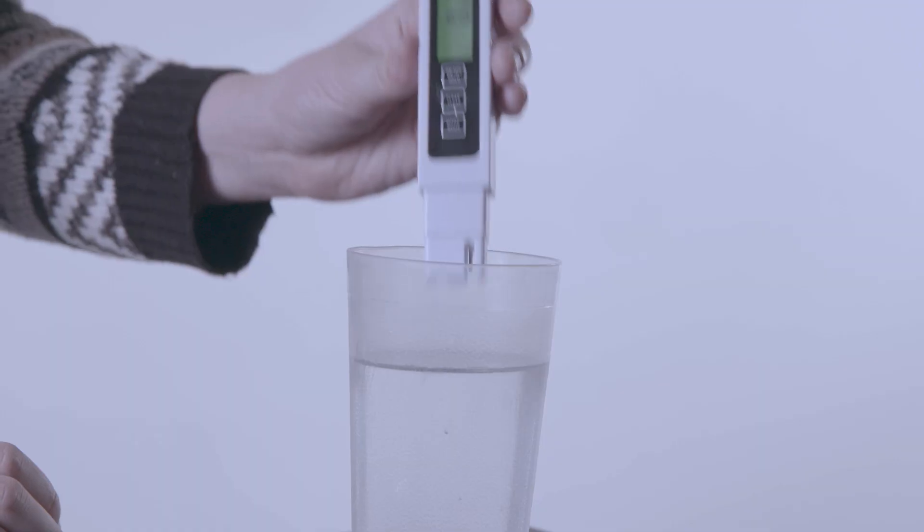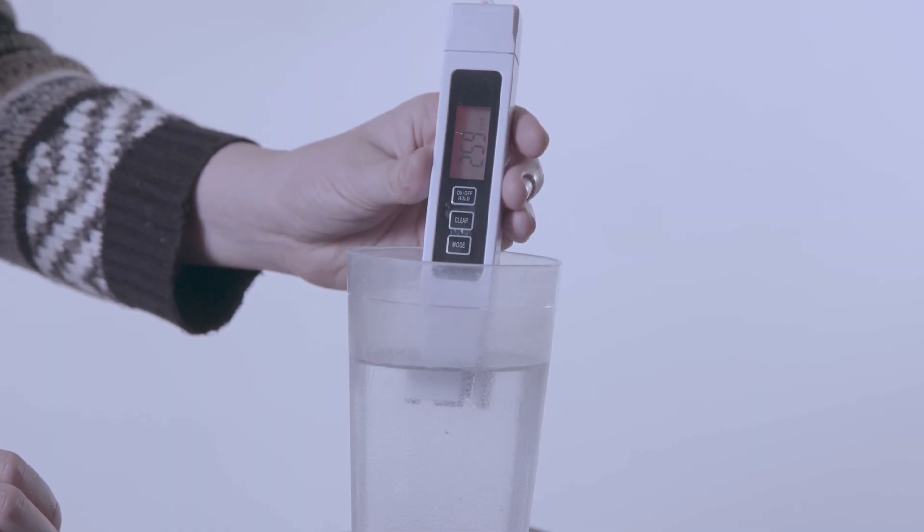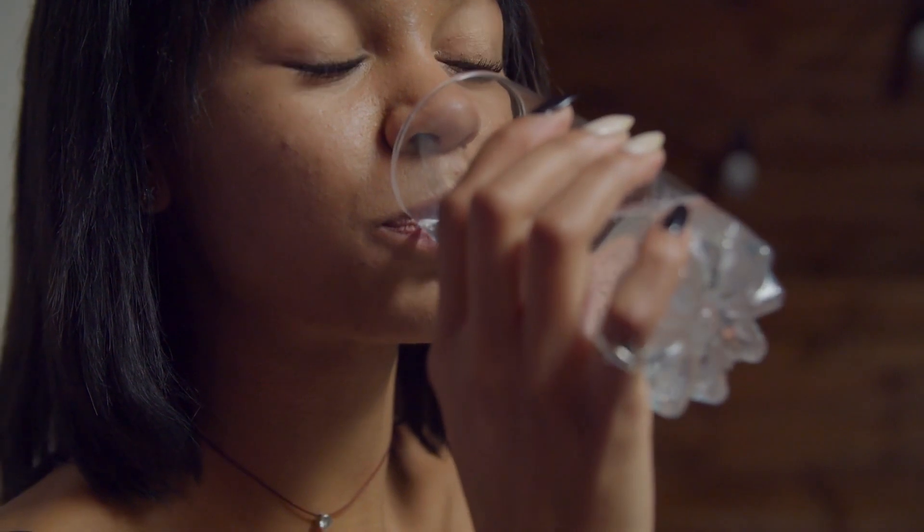A TDS meter is used to measure the total dissolved solids in water. Total dissolved solids are minerals in the water like calcium, magnesium, and sodium. These minerals are what give water its taste.